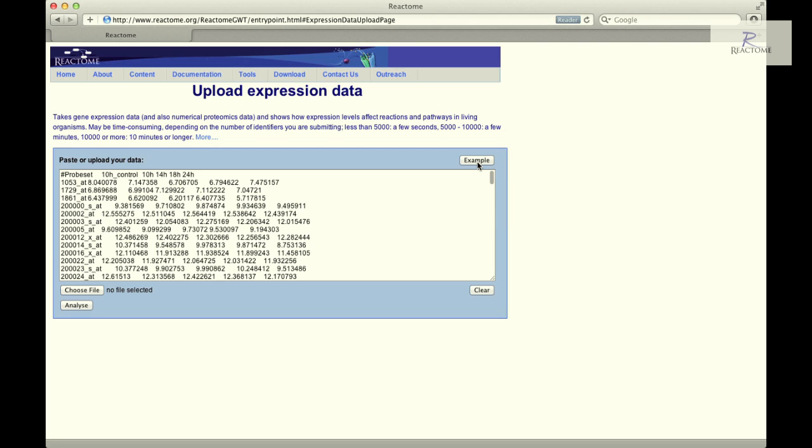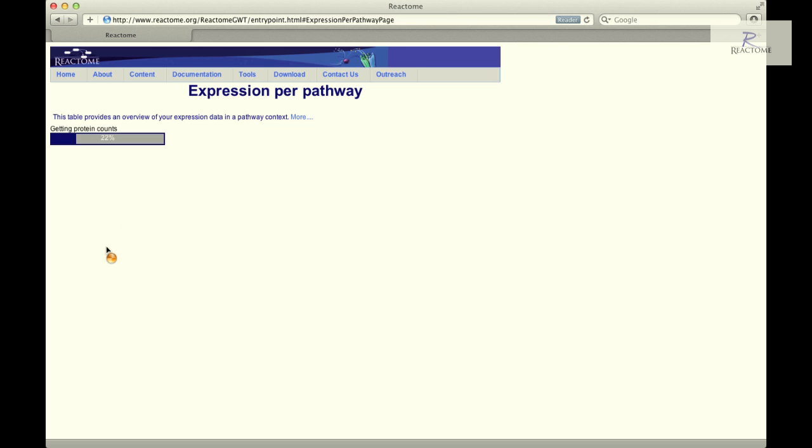Click the Example button on the Upload Expression Data page and then click the Analyze button to perform the expression analysis.